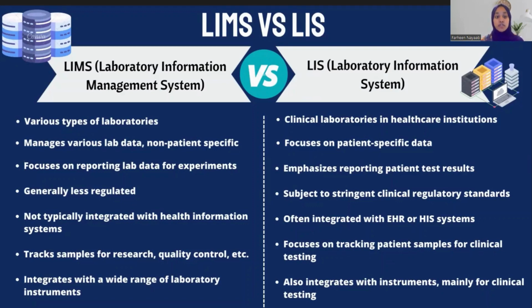LIMS manages various lab data, which is not necessarily patient-specific, while LIS only focuses on patient-specific data. LIMS focuses on reporting lab data for experiments and other purposes, which is used outside of clinical settings as well, while LIS emphasizes reporting patient test results and patient data.